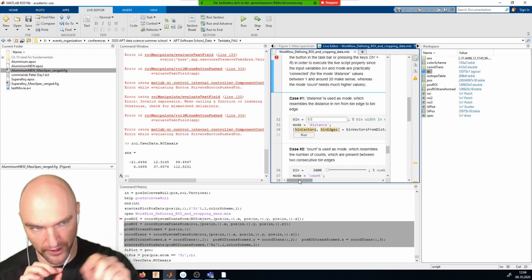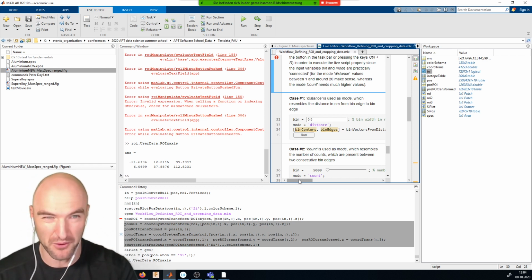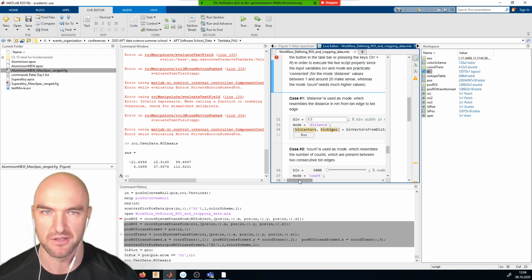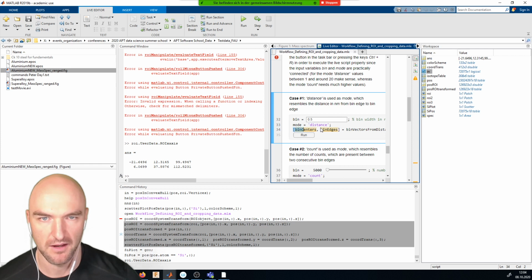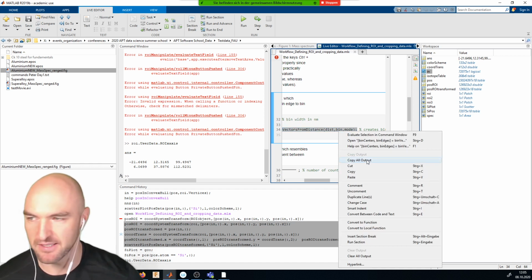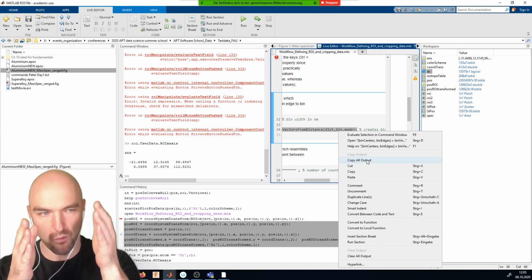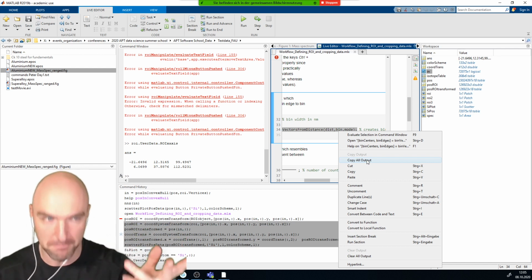In the middle, when we do a radial profile, or a spherical profile, in the middle we would have very few counts. And as we go outwards, we get more and more counts. So in this case, it's usually better to use constant counts. And we can do that using the bin vectors from distance function. And this gives us the bin centers and the bin edges. And in this case, a bin is just, like if we slice things up, a bin is one region of our data set where we take all of the atoms and throw them into one bin.